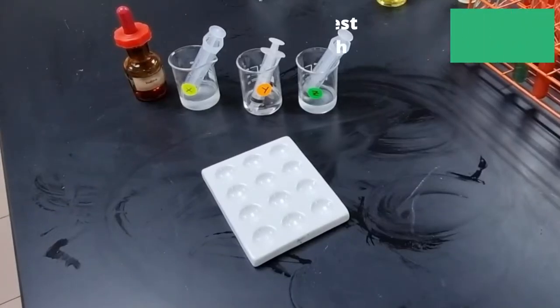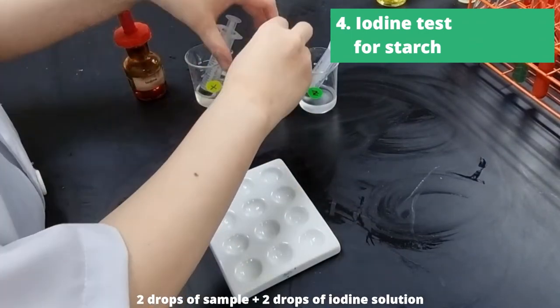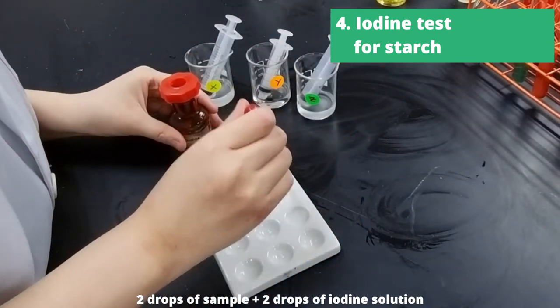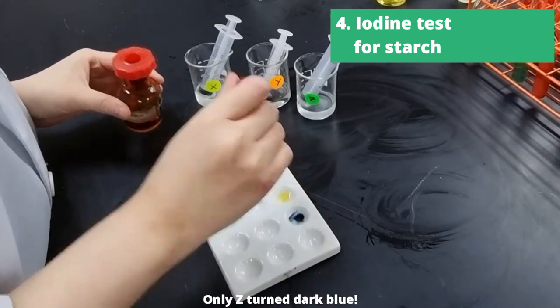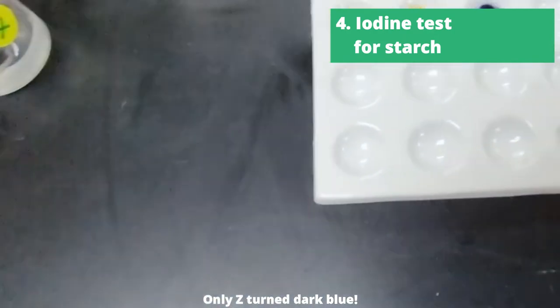Last but not least, we did the iodine test for starch — the easiest test ever. Two drops of the sample to two drops of iodine solution, and we did this for unknown solutions X, Y, and Z. Unknown solutions X and Y remain yellow, whereas Z turned dark blue.